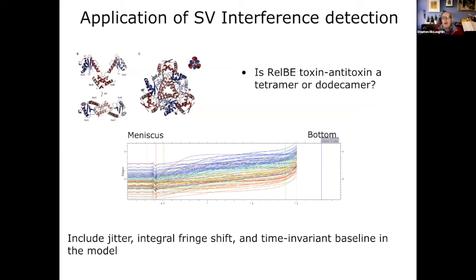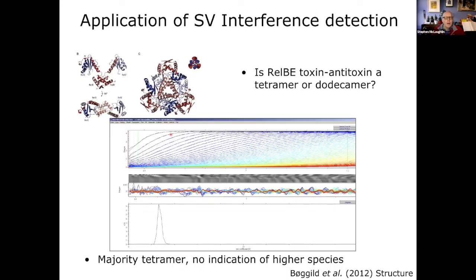Here's an example of interference detection from a project with Lori Passmore. They had solved a structure and the question was whether the complex was a tetramer or a dodecamer, as another group had published a structure with a different number of subunits. The sedimentation data looked noisy with jitter, but using time-invariant correction we could fit the data and find that the majority of the protein was in a tetrameric form, confirming the crystal structure was correct with no significant higher-order species.